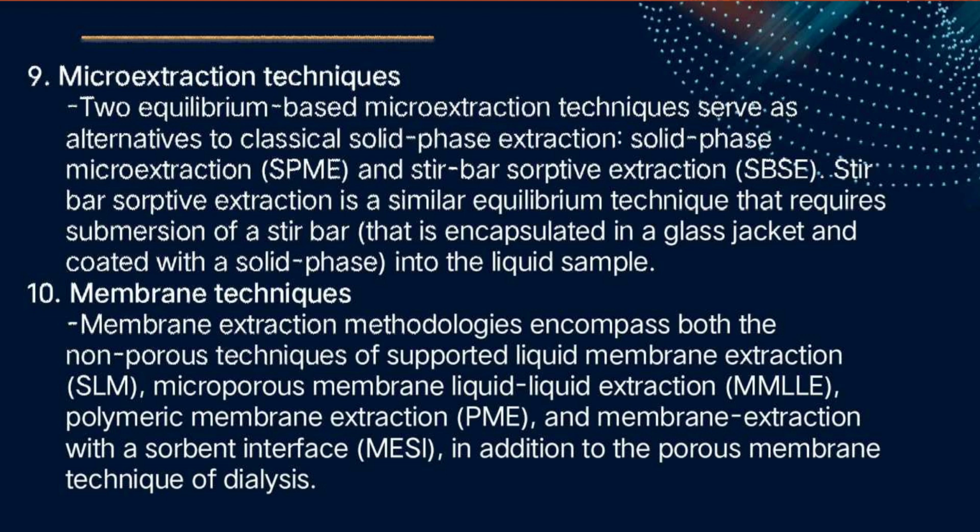Microextraction is defined as an extraction technique where the volume of the extraction phase is very small in relation to the volume of the sample, and extraction of analyte is not exhaustive.